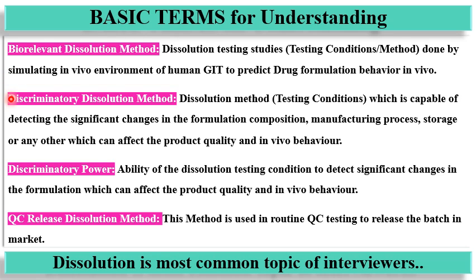That is, dissolution testing done by simulating the in vivo environment of the human GIT to predict drug formulation behavior in vivo.